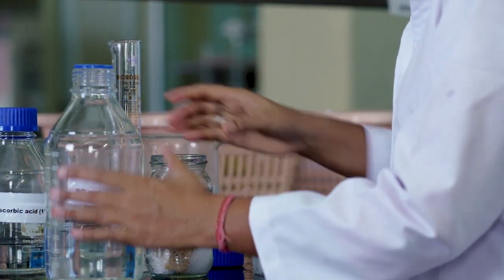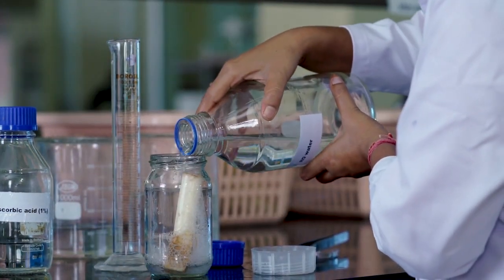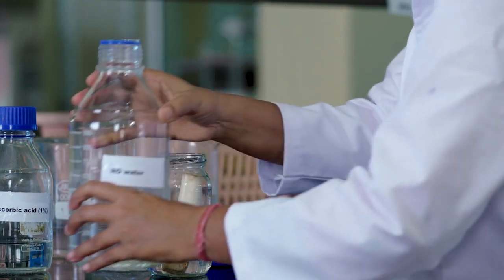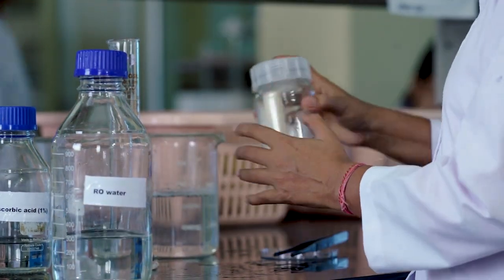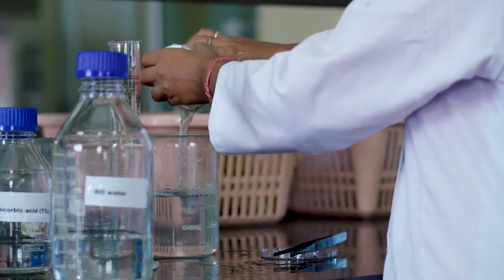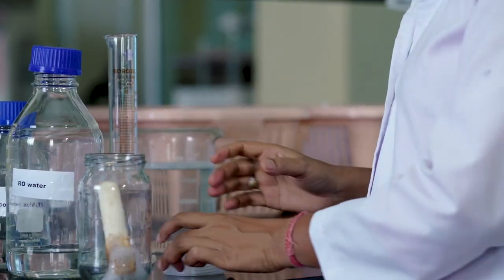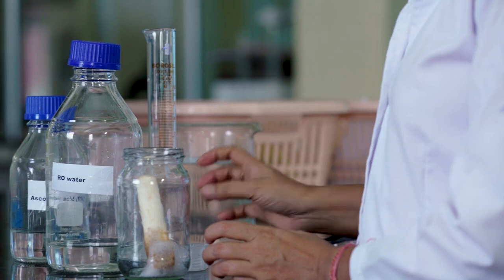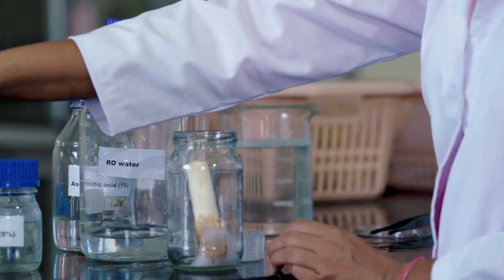Once we have used Tween 20, we need to again use sterile RO water or distilled water to remove the Tween 20 from the explant. So 3 times we can wash the explants using sterile RO water. Here, as you can see, she is using sterile RO water to remove the Tween 20 from the explants.